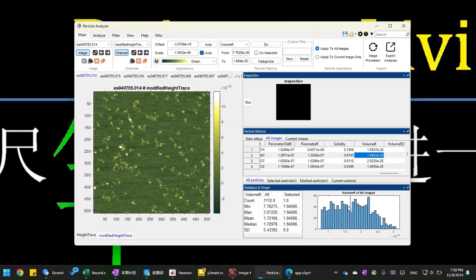So once you do that, now the reason I placed the bar here is because I can see there may be two species of volume. So we have a lower volume, maybe peaked at 1.25 here, 1.2 here. We also have another peak at around 2 or 2.25. So maybe it's a broad distribution, but we can roughly categorize them into two different species.